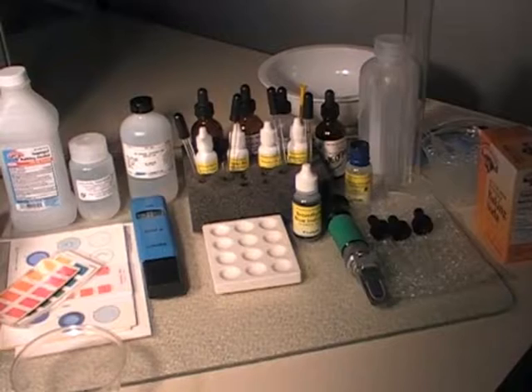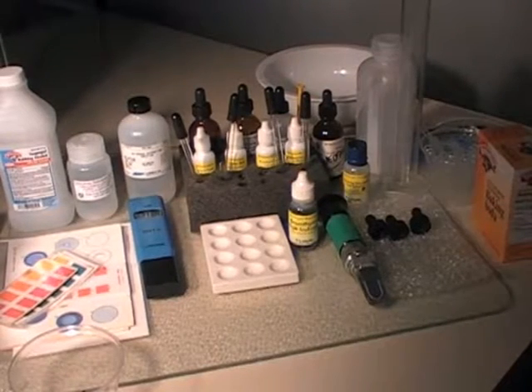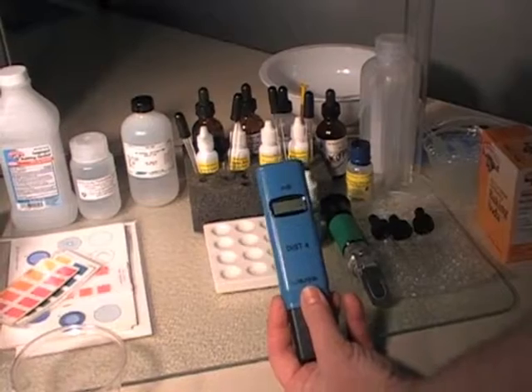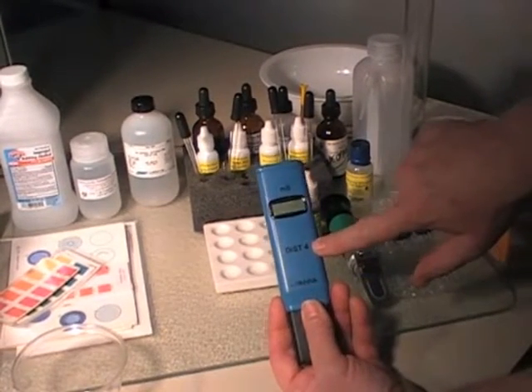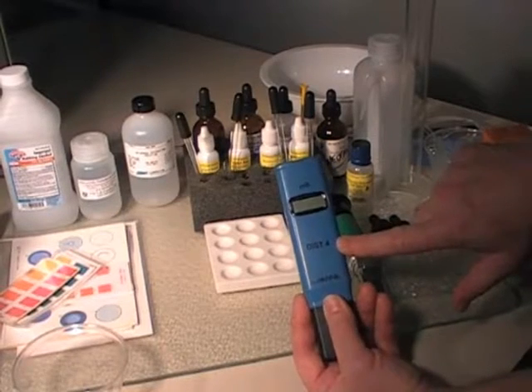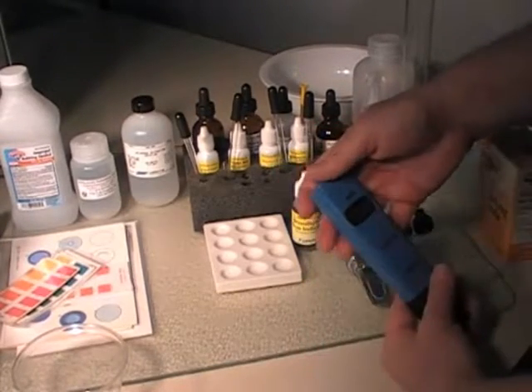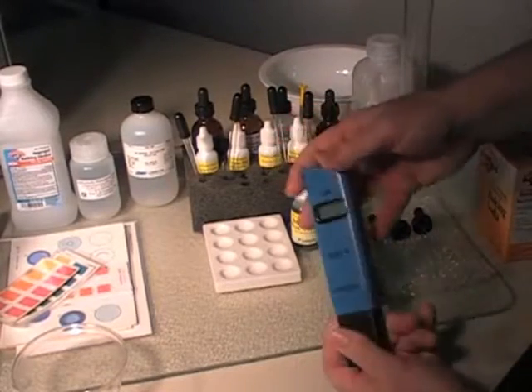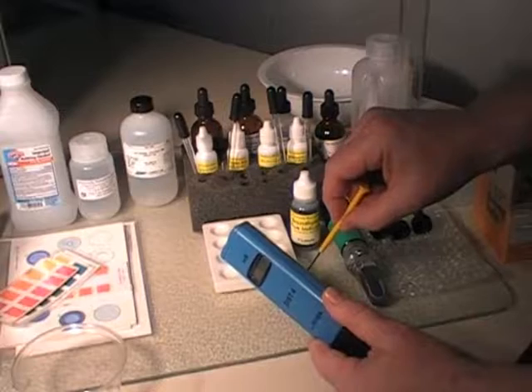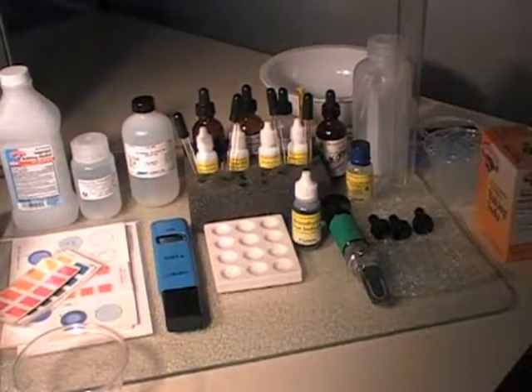The next meter you'll need is the conductivity meter, made by Hanna — specifically the dist4 meter, which costs about $58. It works just as well as the $96 or $390 meter; I've compared all three and there's no need to spend more. It's simple to use and comes with a small screwdriver for calibration. We'll show you how to calibrate it when we cover salt testing.